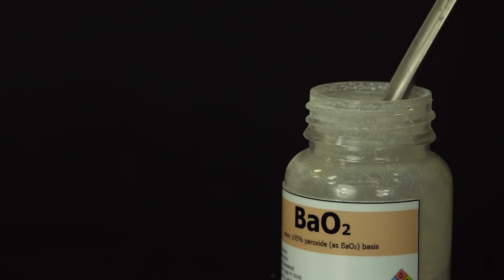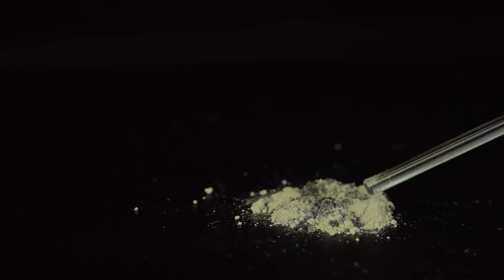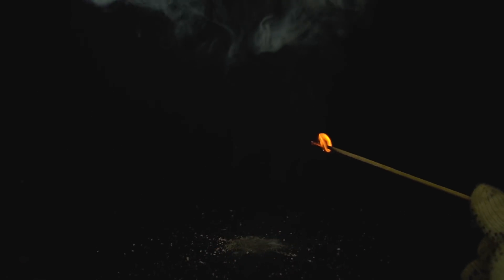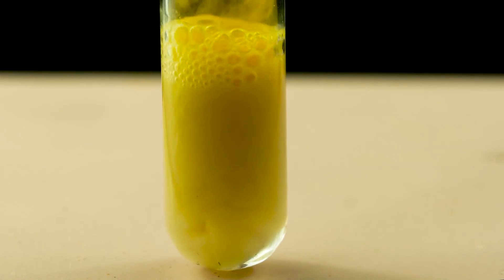And here is a reaction with barium peroxide. Metallic samarium is actively dissolved in nitric acid, but samarium nitrate anhydrous cannot be obtained from this solution — only the crystallohydrate.